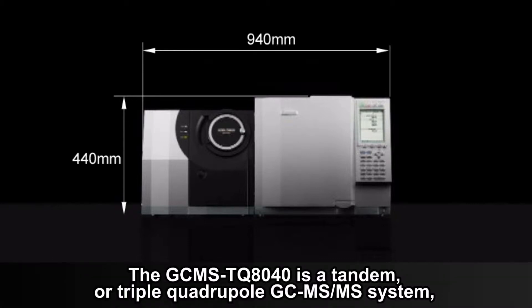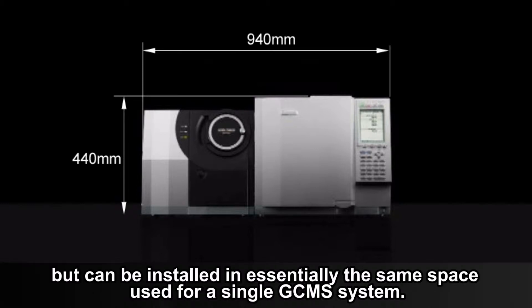The GC-MS TQ8040 is a tandem or triple quadrupole GC-MS/MS system, but can be installed in essentially the same space used for a single GC-MS system.